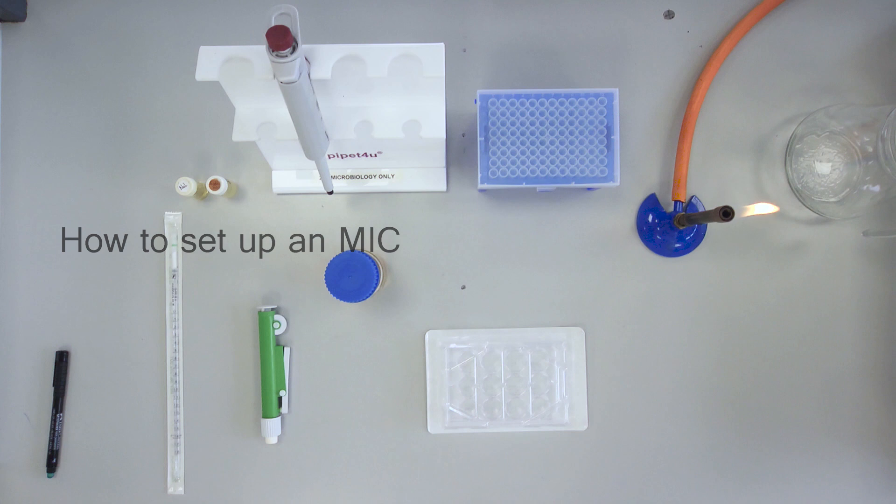How to set up an MIC. This experiment allows the determination of the minimum inhibitory concentration of nalidixic acid for a strain of Escherichia coli.